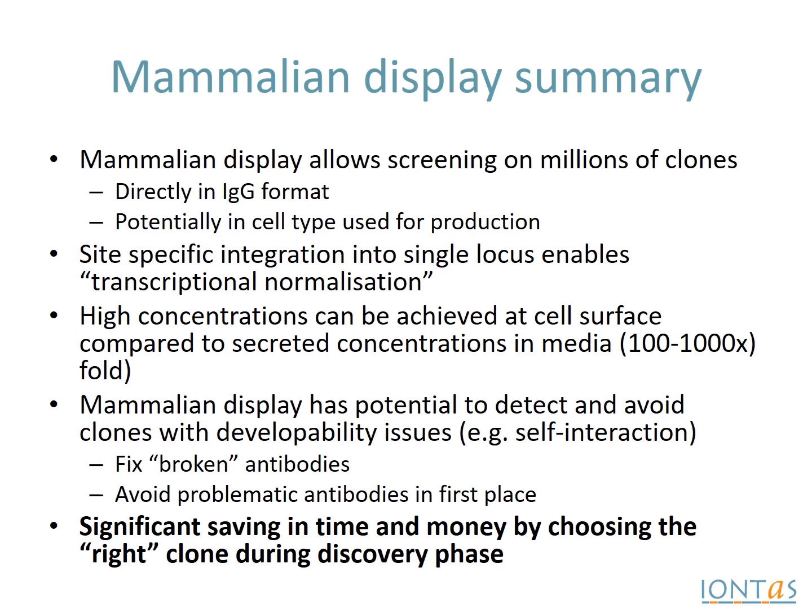In particular, I think it's important that we can achieve high concentrations of the antibody on the cell surface, and therefore in this very early discovery step we're actually achieving the sorts of concentrations that are often required to generate high concentration of antibody, for example for subcutaneous administration.